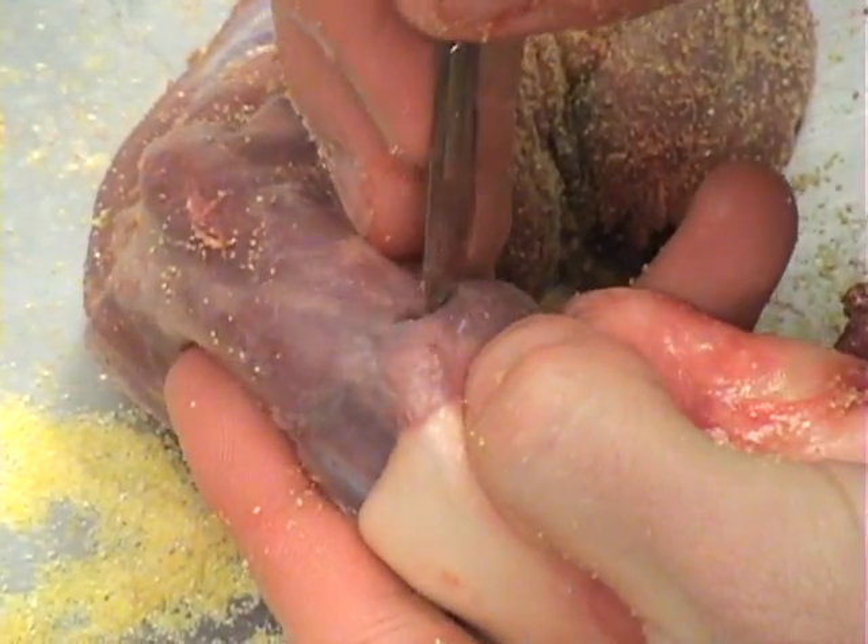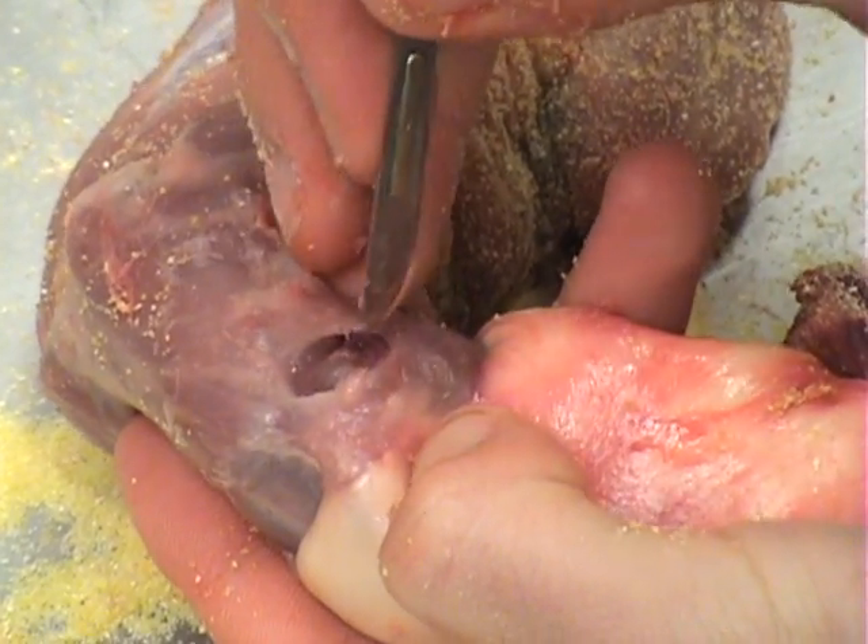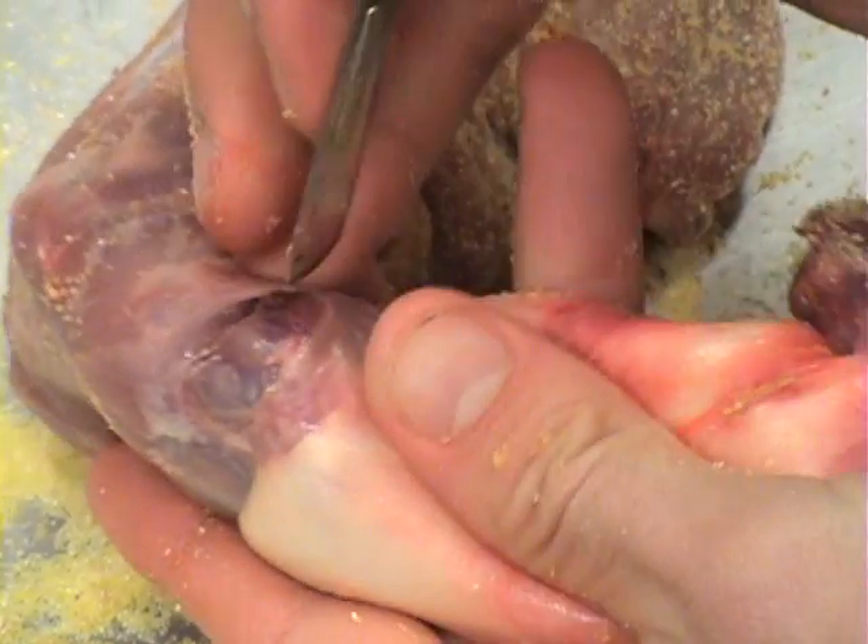If the ear is cut too far forward, cotton may show on the finished study skin. This needs to be done for both ears.